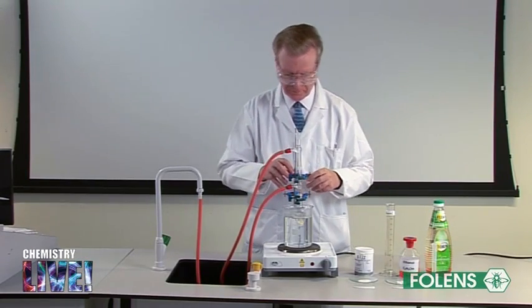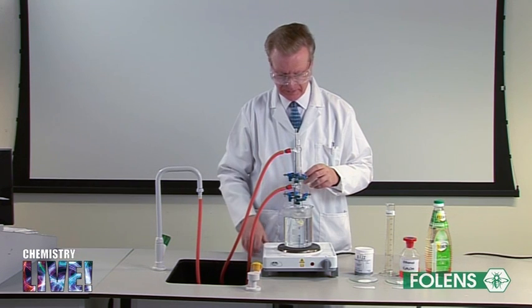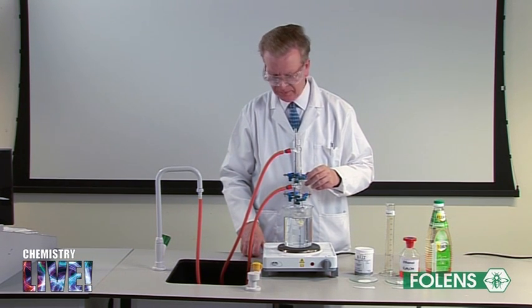The ethanol acts as a solvent for the oil. The reflux apparatus was set up as shown.